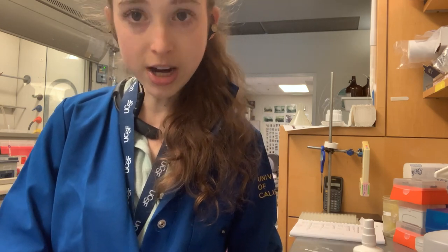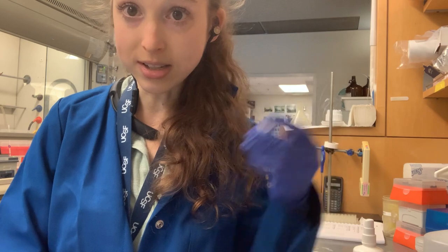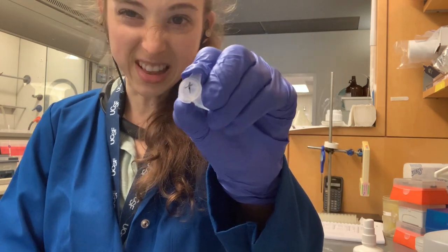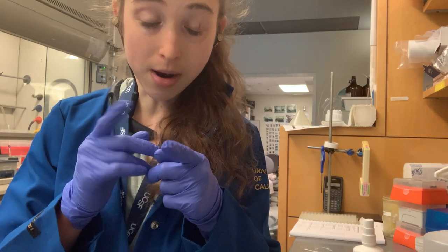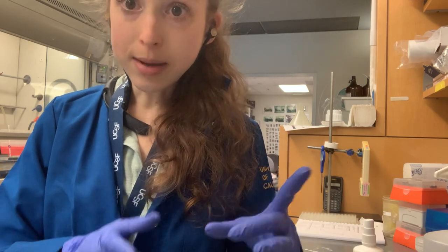It's easy to have multiple tubes and think you'll remember which is which — and then you don't. Maybe you put something in a centrifuge and you're just using a balance tube you found that isn't labeled. You stick them both in the centrifuge and now you don't know which is which. If you label things, you won't have that problem. And so yes — label, label, label.